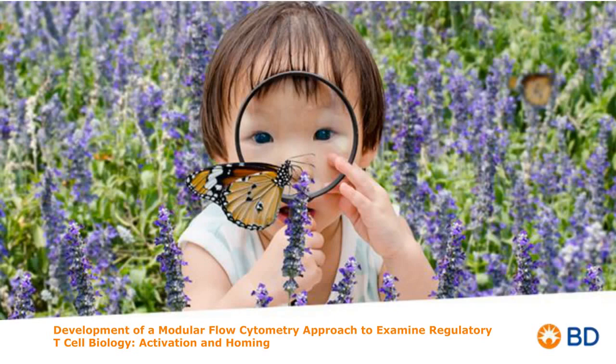I know that BV421, FITC, and APC are very clean fluorochromes, and I could have just saved those as my drop-in panels. But my particular panel design for my application needed me to use those on other markers on my base. So it's definitely a good question, and it's something that needs to be considered when you're designing your own modular panels.